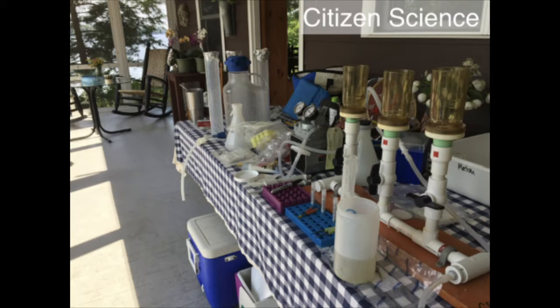We have other technology at the lab and are hoping to invest in this kind of technology. This is the latest quantitative PCR-based technology that's, again, similar to the handheld, but this is a lab-based system, and we found really good results between this newer technology and the technology we've been using.